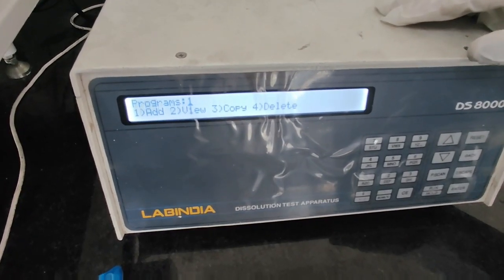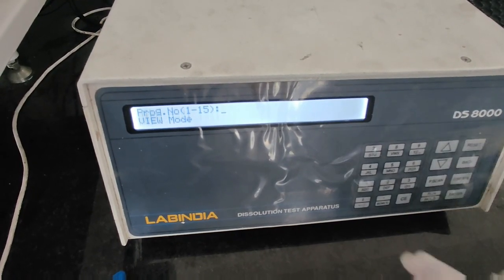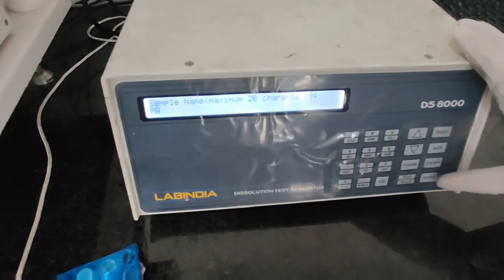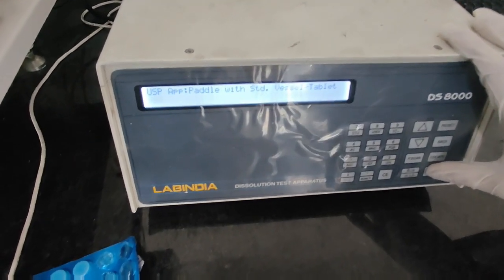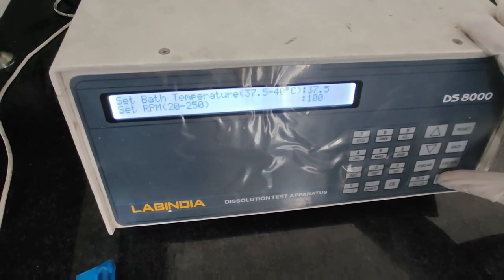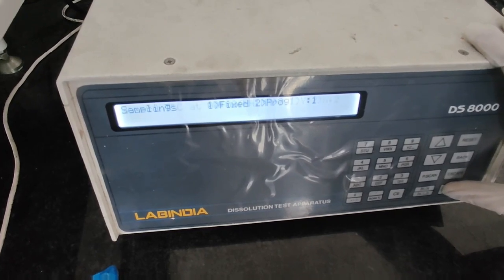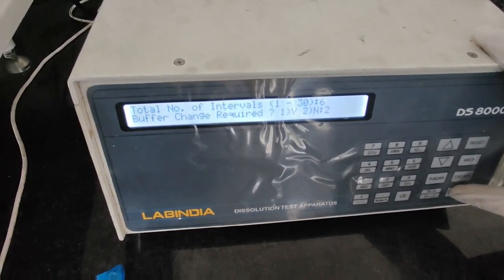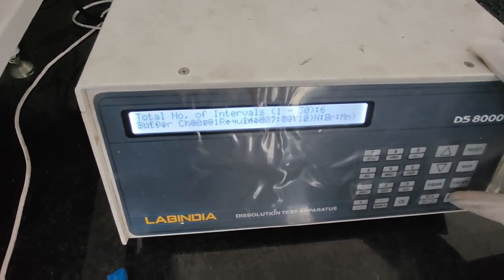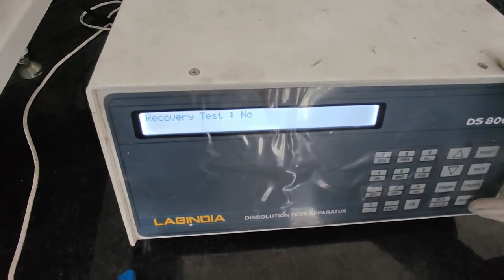Now if you want to view the program which you have set, press 2 and enter. Now it comes in the view mode. You have to enter the program name. It was 14. Press enter. Then PA was my sample ID. I have selected paddle type apparatus. Buffer volume will come. Then temperature is showing, and then bath temperature which I have set. RPM I have selected 100. Sampling is manual. Recording temperature 0, I don't want that. Sampling is fixed. Buffer change is required: I have selected no. Total number of intervals I have taken 6. Interval time is 10 minutes. Recovery test: no. So it is showing the program.